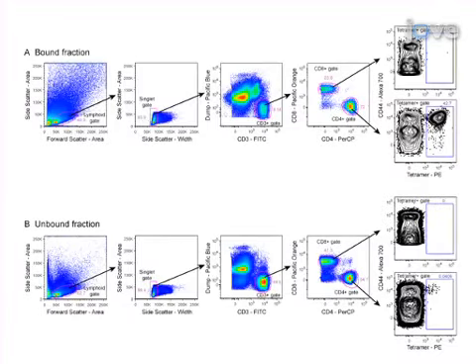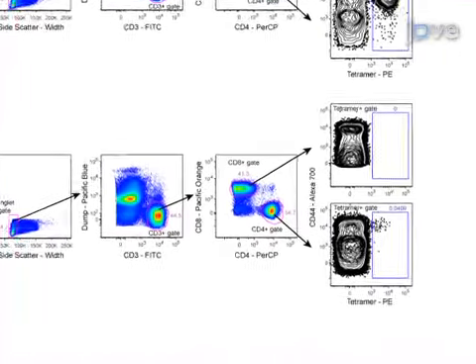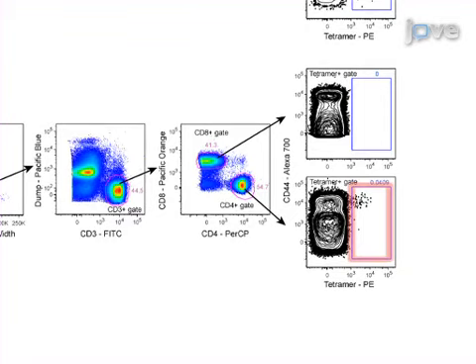The efficiency of the enrichment declines as the number of epitope-specific T cells increases, so tetramer-positive cells may be seen in the unbound fraction of samples containing very high frequencies of epitope-specific T cells. In such cases, the number of epitope-specific T cells present in the unbound fraction can be calculated separately and added to the number found in the bound fraction.